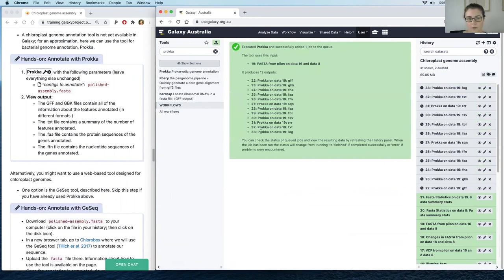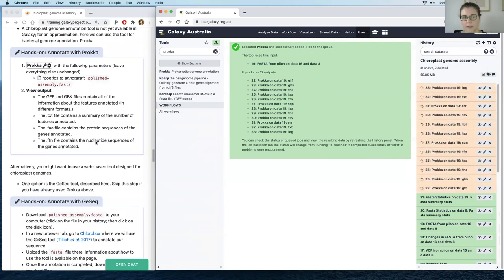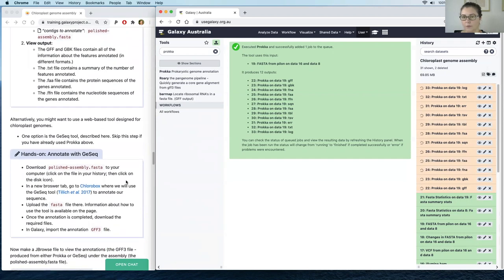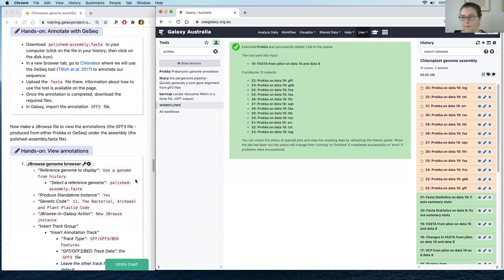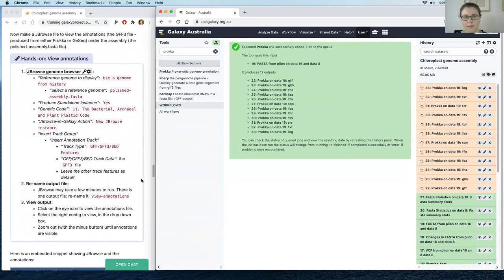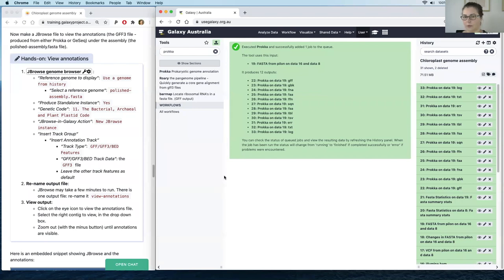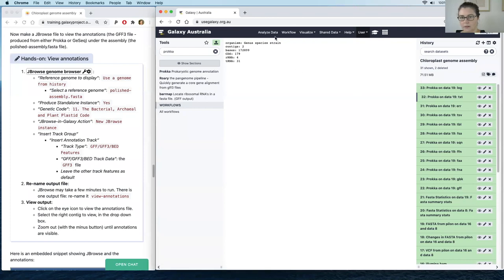Prokka makes a lot of output files and you can explore those by clicking the eye icon once the tool has run. Today we'll look at the text file output for a very quick and brief overview of the annotations. Prokka has finished — clicking on the text file, we can see it's found lots of coding sequences, some ribosomal RNAs, and some transfer RNAs. That's a brief example of how we might do an annotation. Now let's view it using JBrowse.